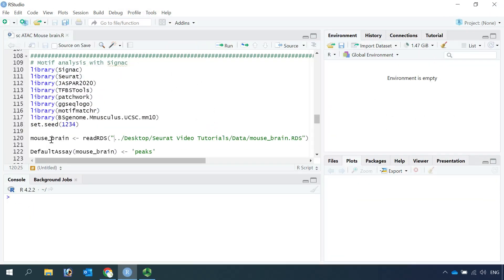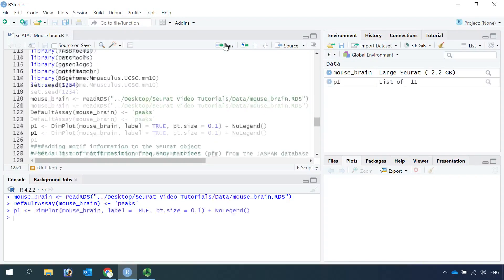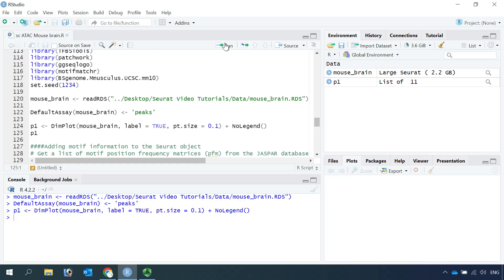Let's go ahead and read the mouse brain Seurat object into R. First, you need to load all required packages listed here for this analysis. So we can read the mouse brain Seurat object. We have two assays — peaks and RNA — in the object. So we can set the default assay as peaks.